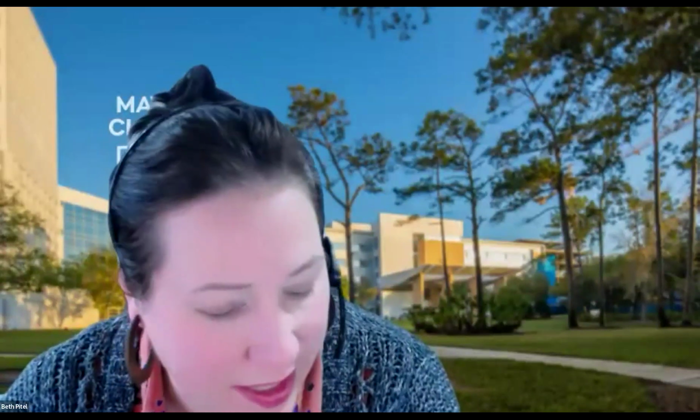Great. Thank you so much for that presentation. It's reminiscent of some technologies we've seen, but it also has a different flavor to it. One thing that I have noticed in some structural variant detection technologies, and it seems like EGM has the same limitations, is the high molecular weight DNA. I know a lot of tumor samples that we see in our reference laboratory are processed and formalin fixed and paraffin embedded. So what kind of measures have laboratories taken to ensure high molecular weight DNA coming out of tumor samples?